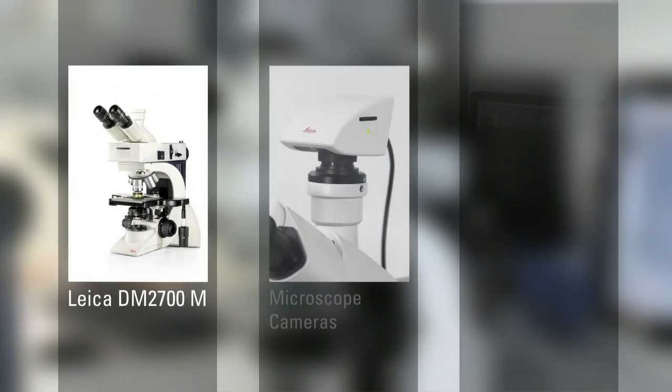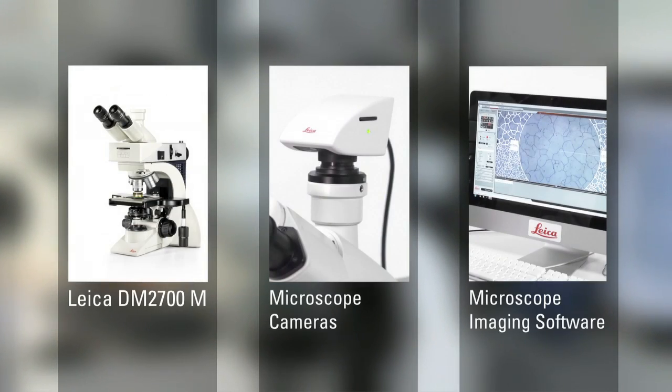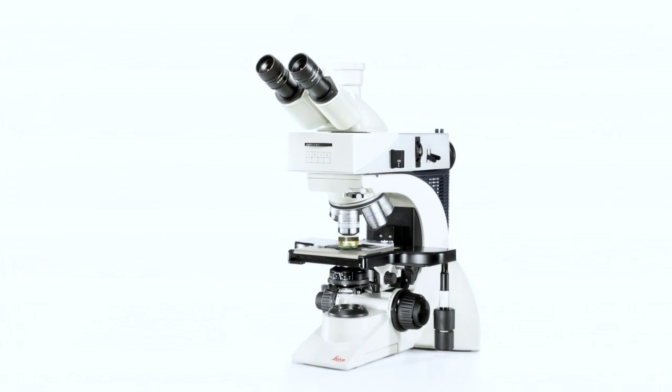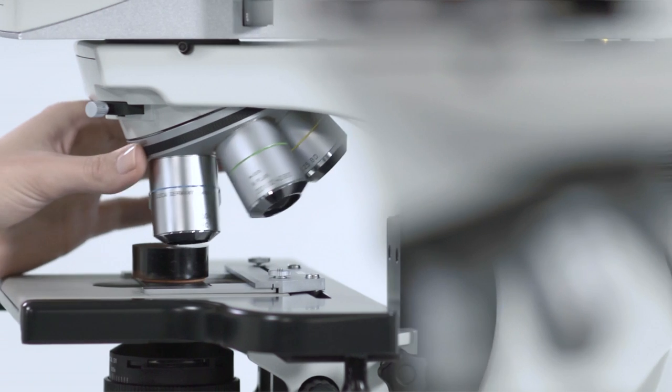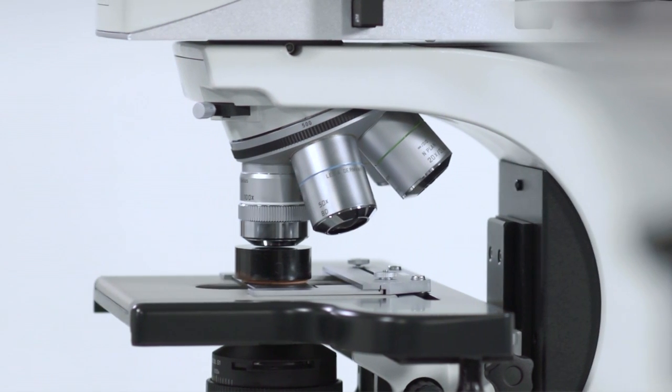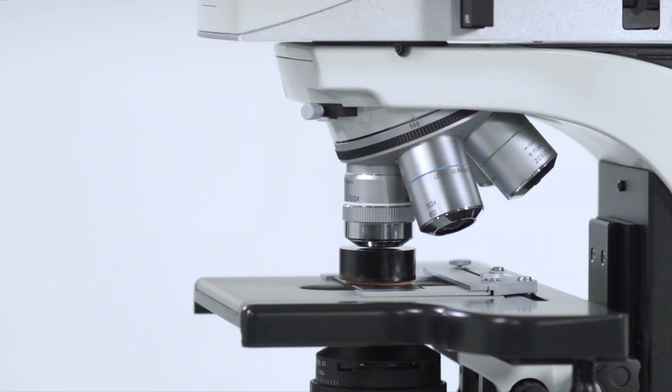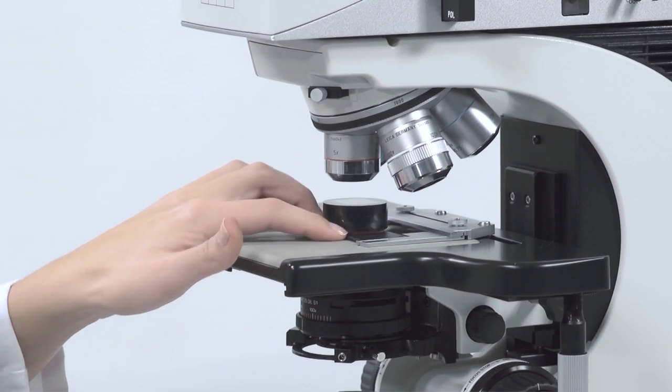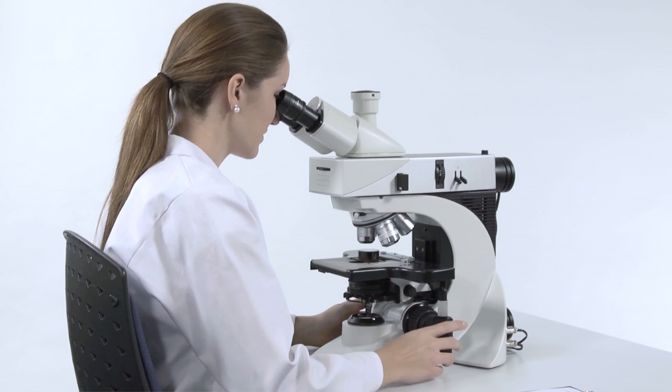The DM2700M with software, digital cameras, and accessories—the ideal combination for your quality management viewing, analyzing, and documentation needs. Everything starts with high-quality optics of the Leica DM2700M. Easily locate and focus on your area of interest from macro to micro, providing you clear and accurate viewing of samples.